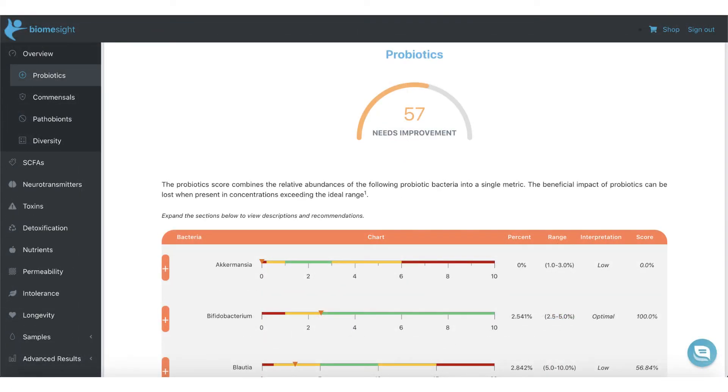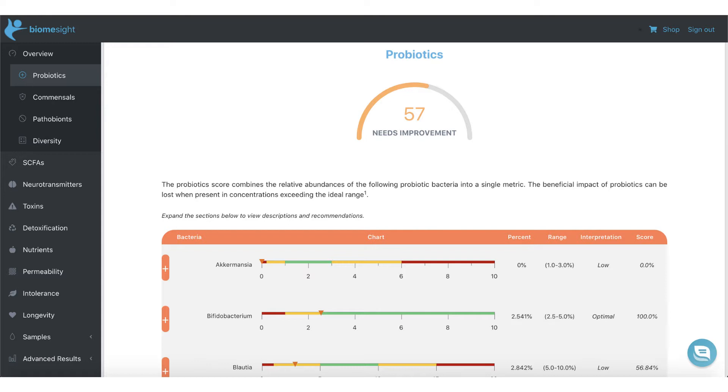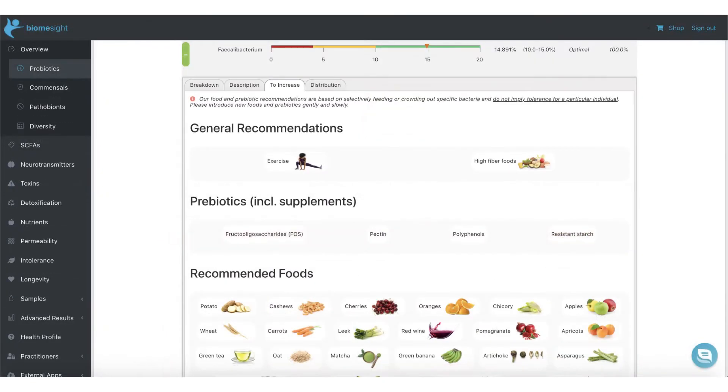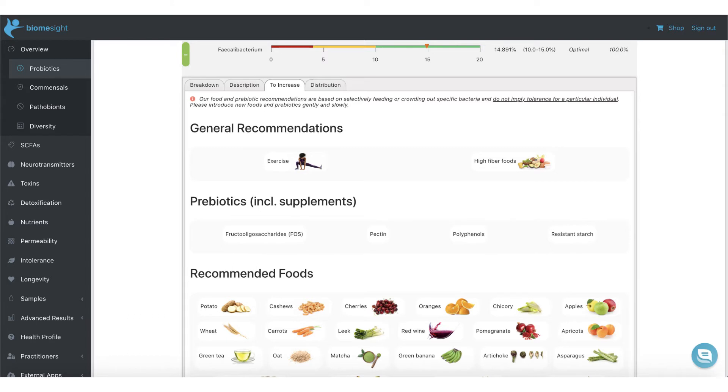The probiotic section gives a breakdown of the key probiotic and butyrate-producing bacteria. You can see how you compare to the ideal ranges as well as the overall distribution. A score is given based on how close to optimal the value is. You can also view recommendations on how to increase or decrease each bacteria as relevant in your case. Our recommendations include a variety of foods based on their prebiotic content, as well as prebiotic supplement recommendations.